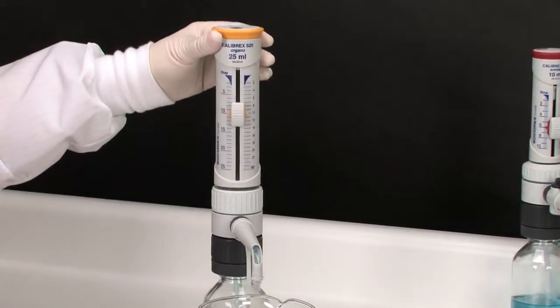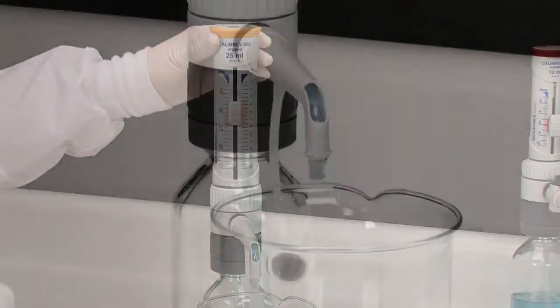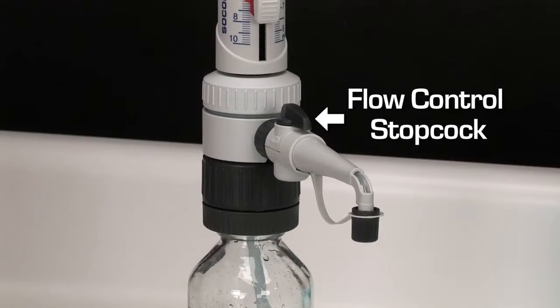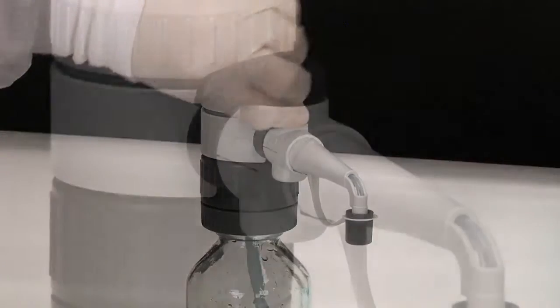Prime the dispenser until no air bubbles remain in the system. The transparent sleeve allows the user to visibly check for them. On the stopcock model, liquid can be returned into the bottle on the recycle position.